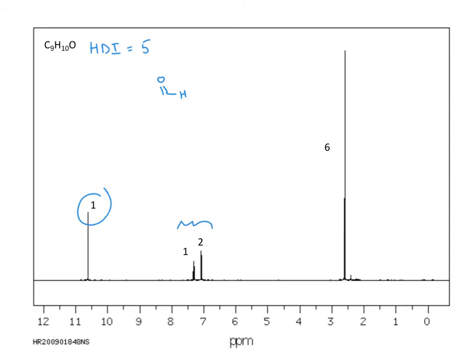And that means that our other 4 degrees are coming from the aromatic ring, which has peaks in a 1:2 ratio. We also have peaks here, so we're going to have 2 methyl groups, and because their chemical shift is 2.5 ppm, that means that they're going to be connected to an aryl ring, or that benzene ring.